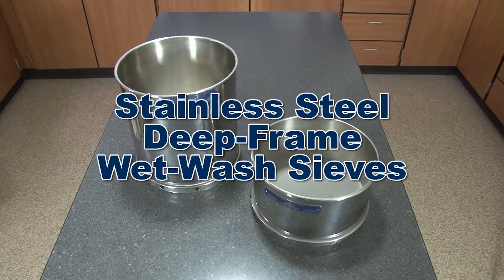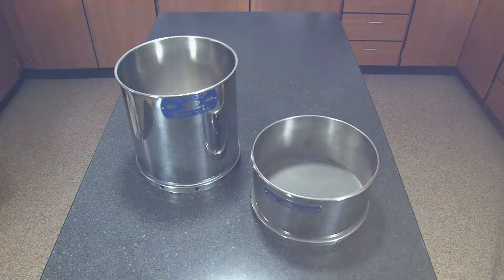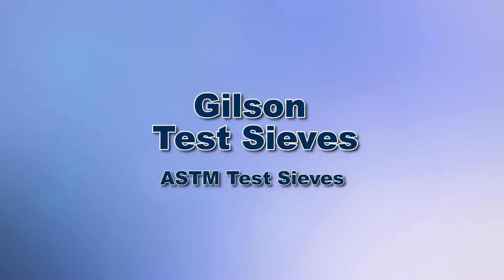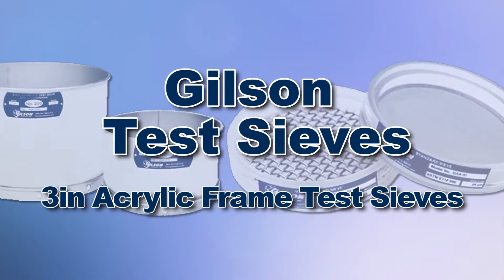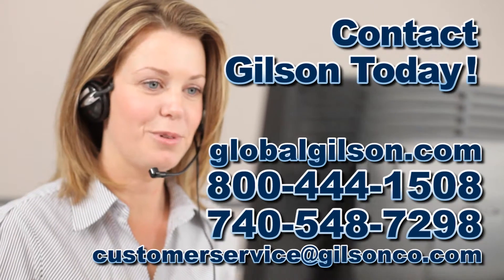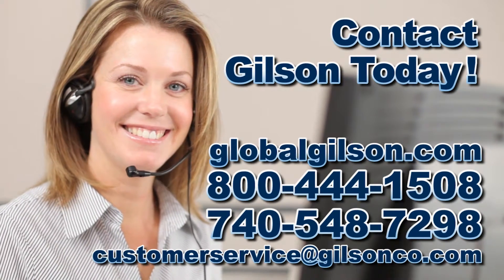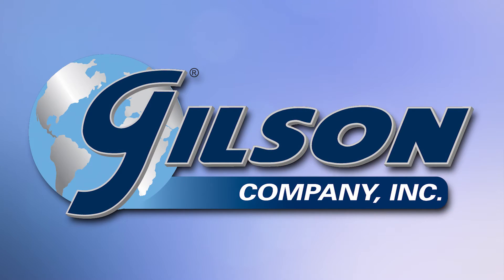Making the Gilson stainless steel deep-frame wet wash sieves the right choice for your material testing lab. With Gilson's complete family of test sieves offering a wide range of performance, features, and capacities, Gilson has the right equipment for your fast, accurate, and reliable sieve analysis. Be sure to check out all our sieve products and services listed in the Gilson catalog and on the Gilson website. Gilson — your industry leader in material testing equipment.